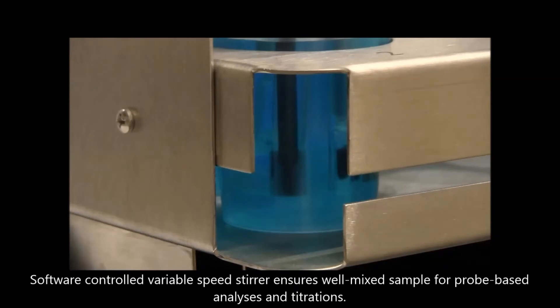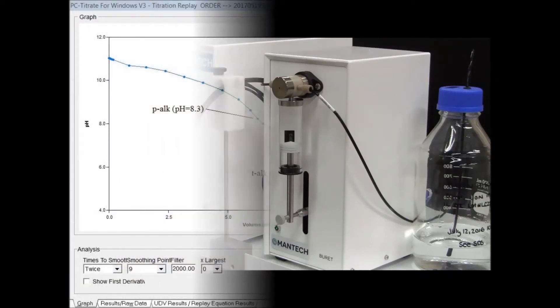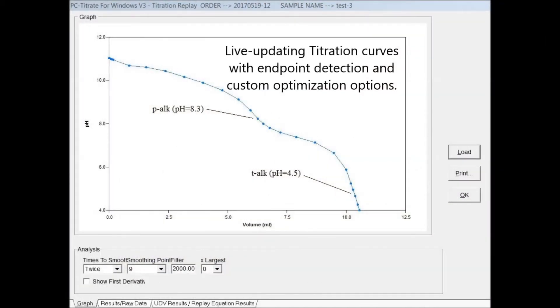A high-speed stirrer ensures a well-mixed sample for probe-based analyses and titrations. Mantec's 94,000-step burette drive performs highly accurate titration injections. Live updating titration curves with endpoint detection and custom optimization options are available.